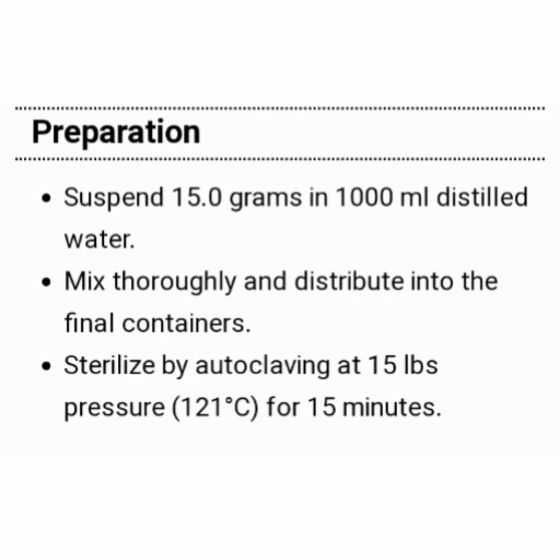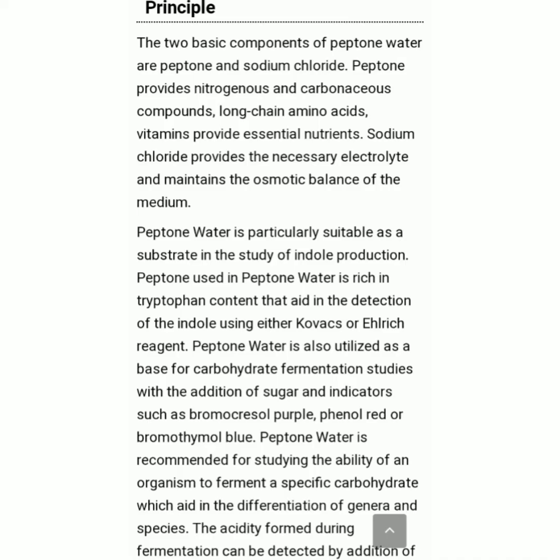And here we can see the principle of this peptone water. Two basic components are present in this peptone water or broth, which are peptone and sodium chloride, right?